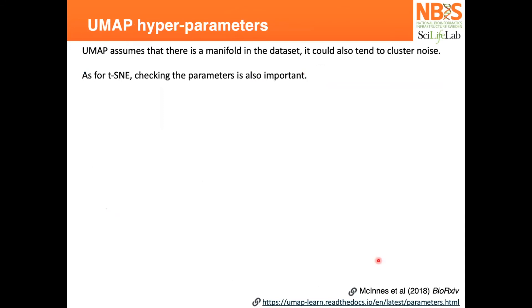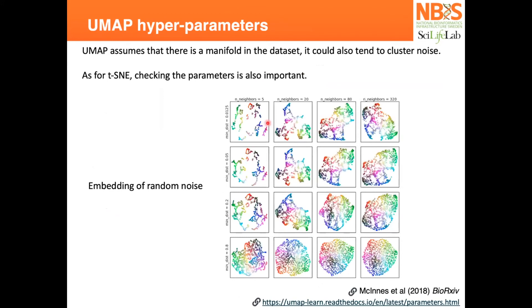As with t-SNE, UMAP has many hyperparameters you need to think about. Here you have the number of neighbors and the minimum distance between points. This dataset is just random noise, but you can create many artificial clusters from random noise. There's nothing in this data.